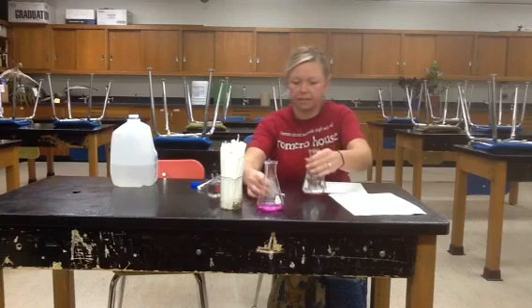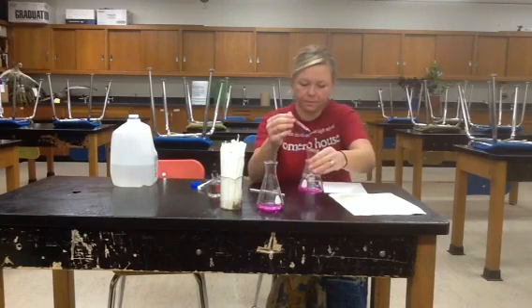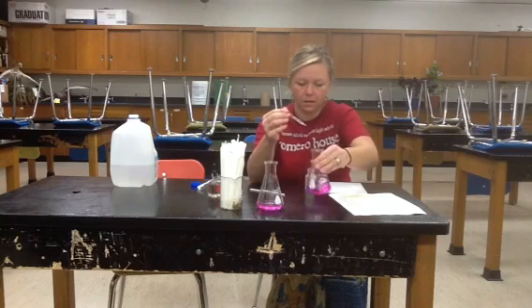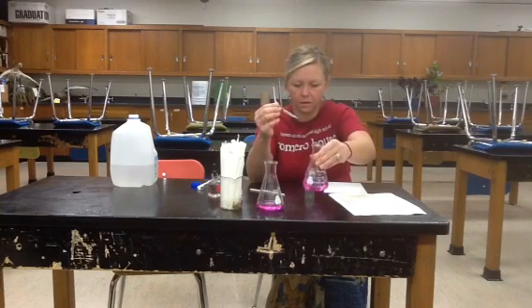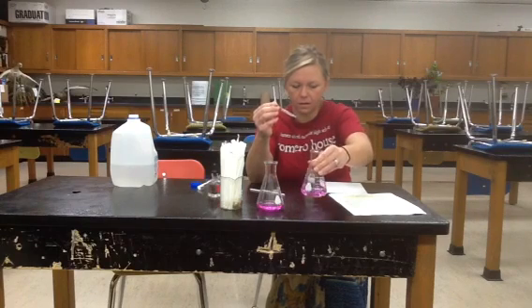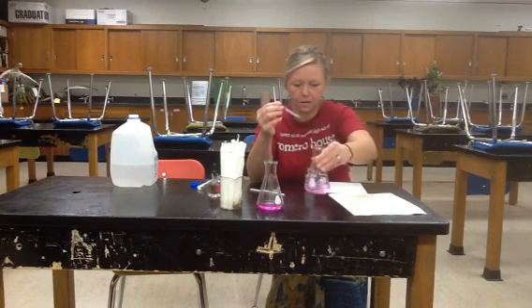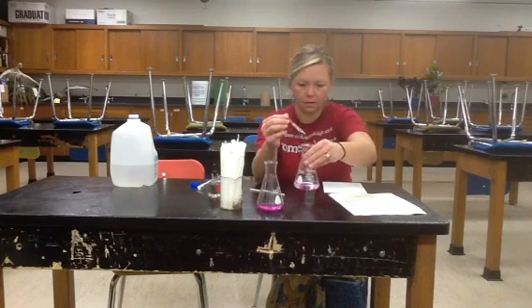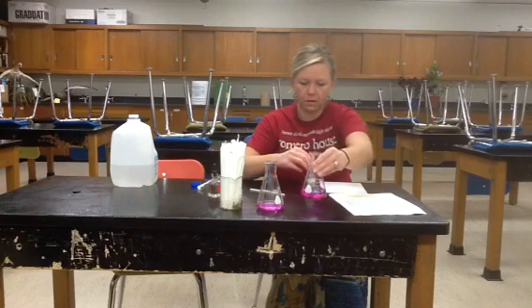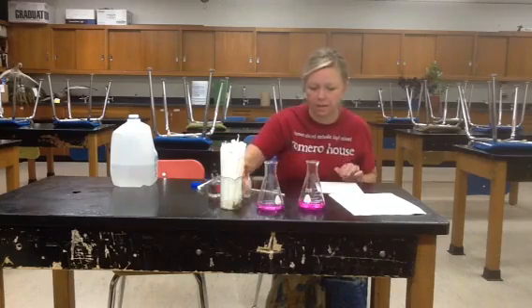Oh, it went back to clear. So we're going to add 1 more drop. I think I'll put 1 more in there. There, our pink color is restored. So that was actually 3 drops of sodium hydroxide.